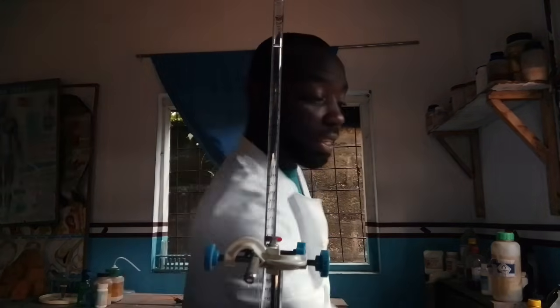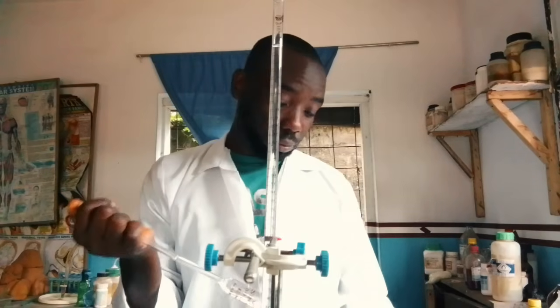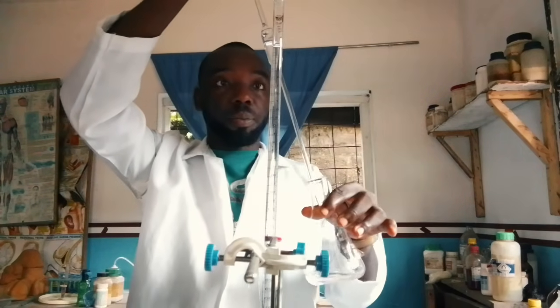Okay, the next thing is I'm going to be pipetting my base, which is the sodium hydroxide solution, which I have already prepared, which is that of B. Okay, so I'll discharge it in here.